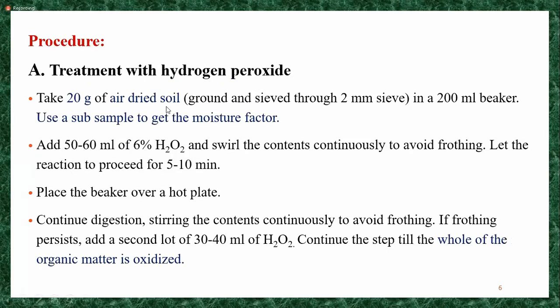So then let's move into the procedure part. For that we are going to use hydrogen peroxide. The first step, we are going to treat with hydrogen peroxide. Do you have any idea why we want to use hydrogen peroxide?